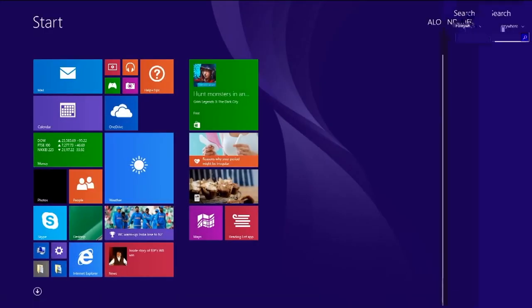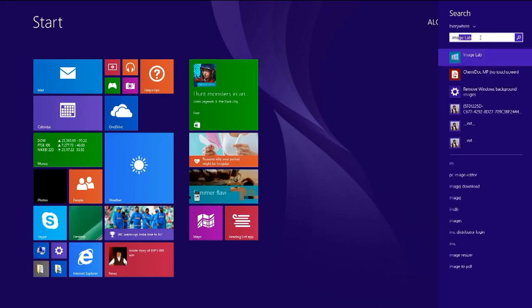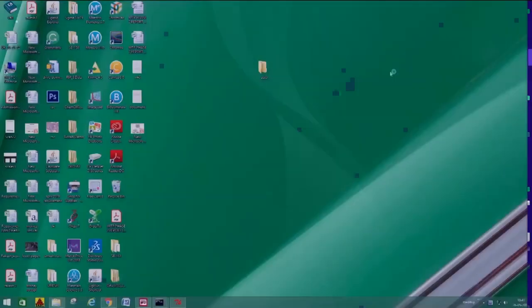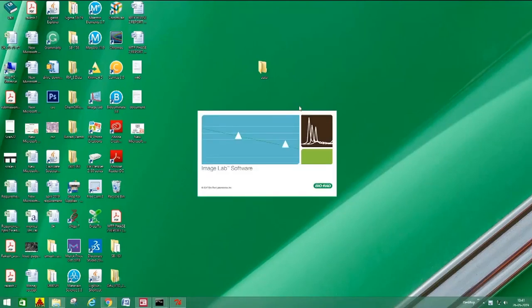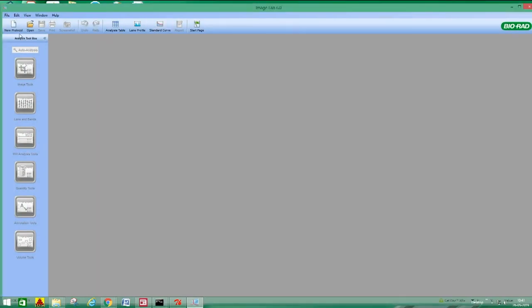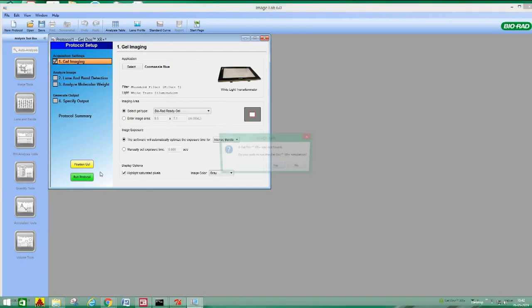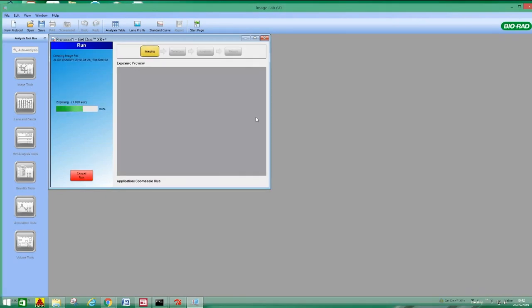So you have to go to start and type ImageLab. So it will open. You need not do anything, we are using the new protocol, so just go. First I will show you how to analyze the protein gels.